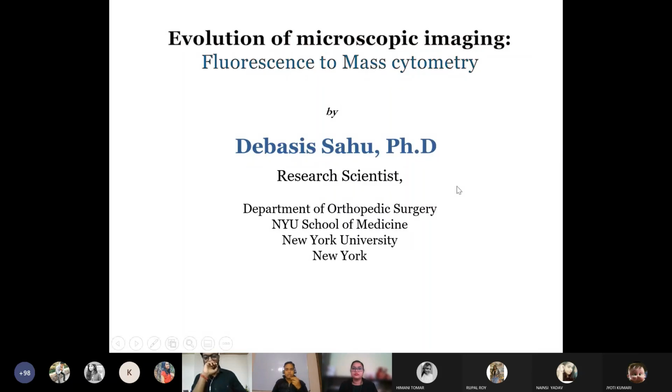Let's start with today's presentation. This is the evolution of microscopic imaging from fluorescence microscopy to mass cytometry. Mass cytometry is actually the imaging version we are going to discuss today. You might have heard of mass cytometry, proteomics. So this is a kind of imaging.